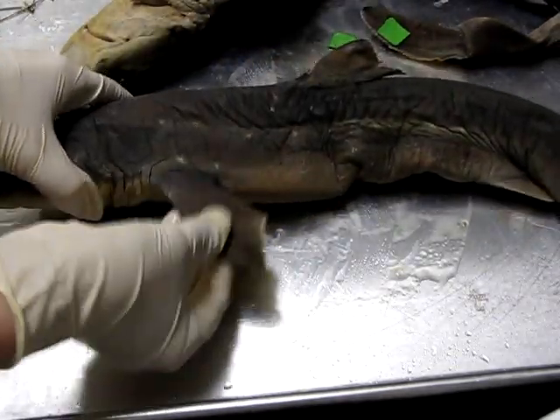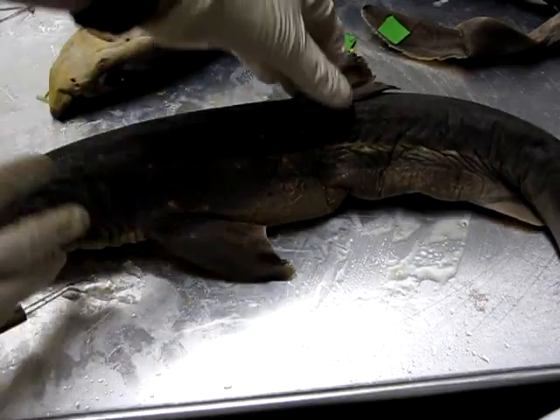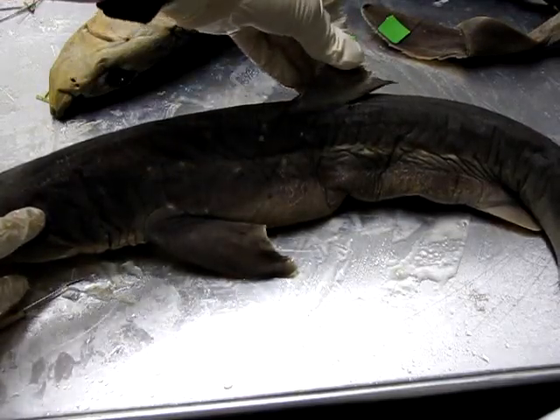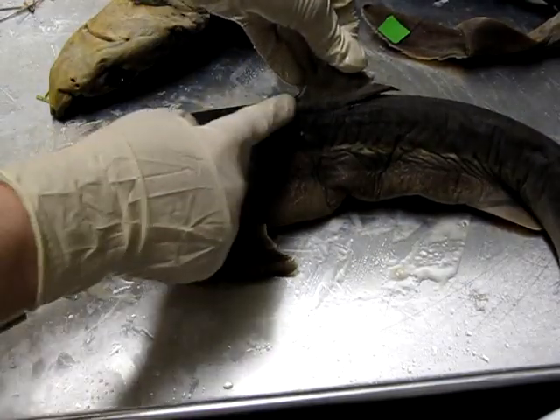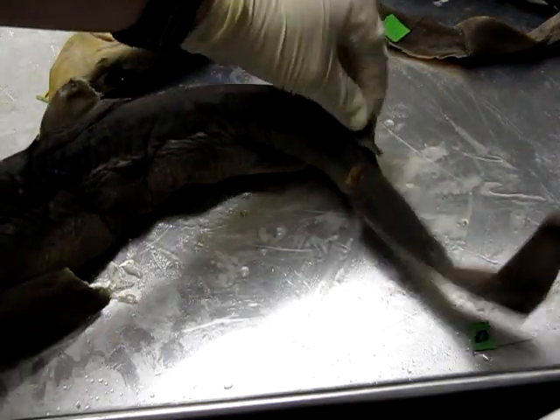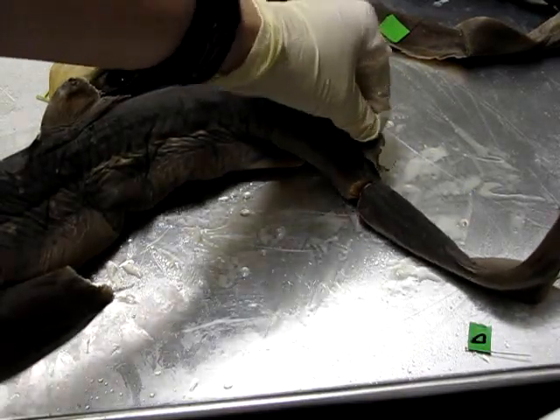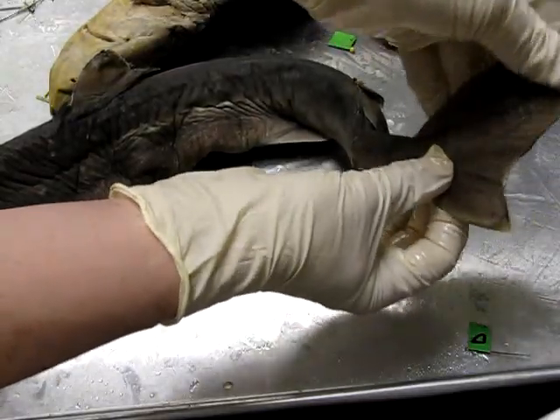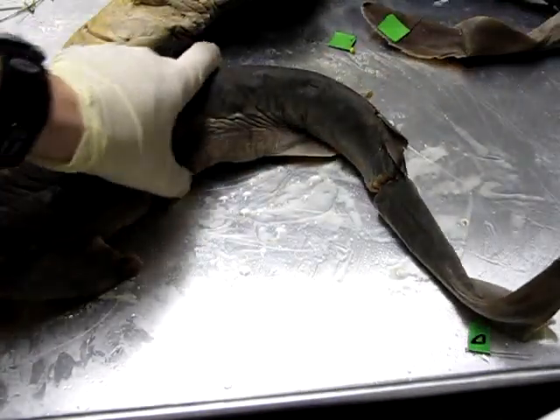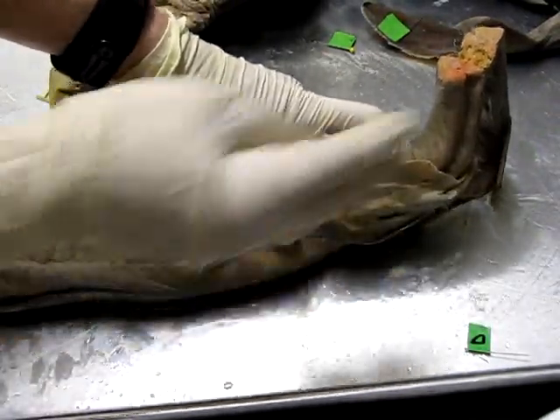Let's look at some of the fins. The ones near the sides on the chest or pectoral area are the pectoral fins. The one on the back here is called the anterior dorsal fin because it's closer to the head. Further down there is a second dorsal fin — this is the posterior dorsal fin. At the end we have the tail, which is the caudal fin.